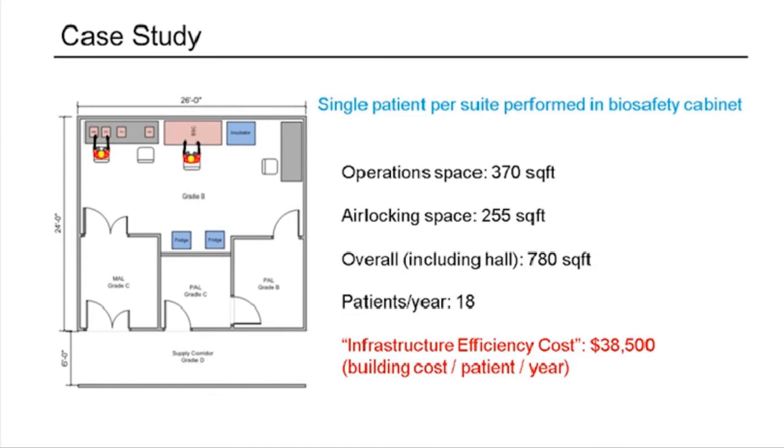And if we, with only one biosafety cabinet, take advantage of the fact that you could have multiple patients in incubators, you might be able to flip that biosafety cabinet in the middle of the day and do one patient operations in the morning and then one patient operations in the evening, but really you're probably only going to be able to get a throughput of 2 patients per day through this.